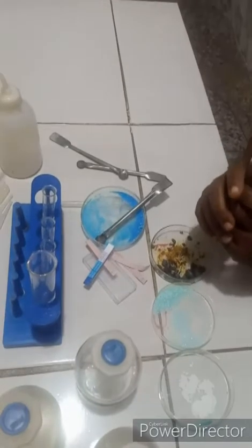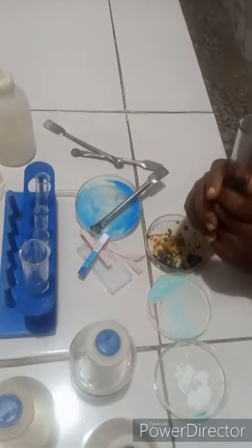As you can see, the solution is blue in color. What will you infer from your observations? Sample A is a soluble salt, and since the solution is blue in color, copper 2 plus is likely present in the salt.